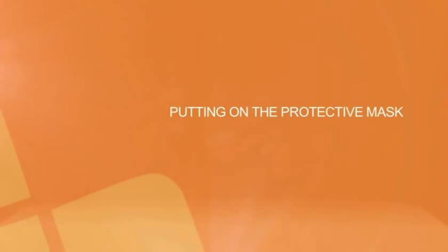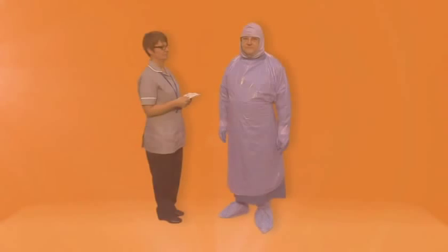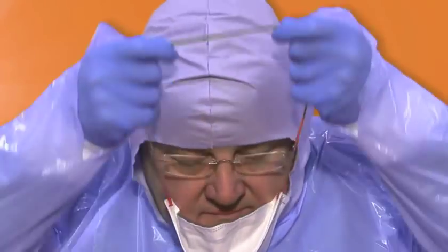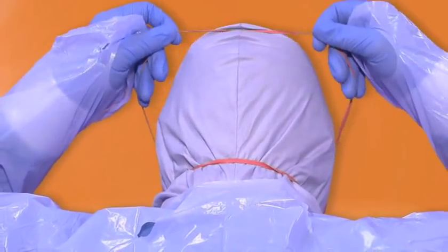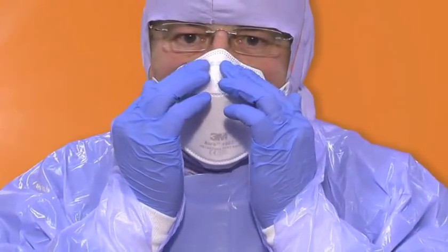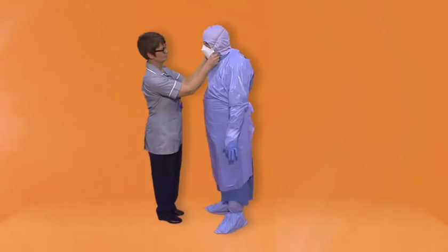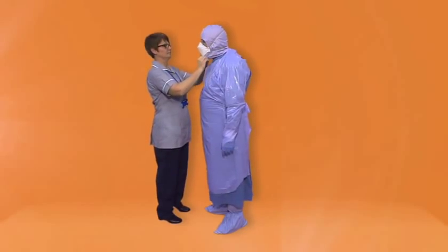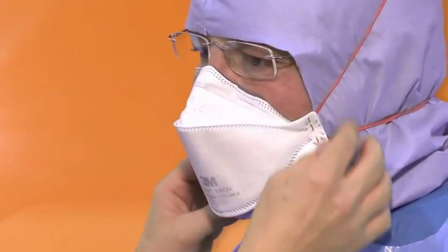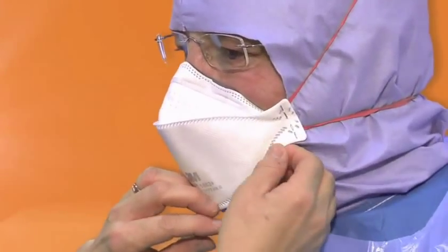Mask. Use a high filter FFP3 mask. All staff need to be properly fit tested. Place the mask over your head. Your buddy needs to ensure that the straps of the mask are in the correct position — one strap at the top of your head and one around the neck at the bottom of your head. Your buddy also needs to ensure that the mask is properly fitted and there is a good seal in place with no exposed skin around the neck. Adjust the mask as required.